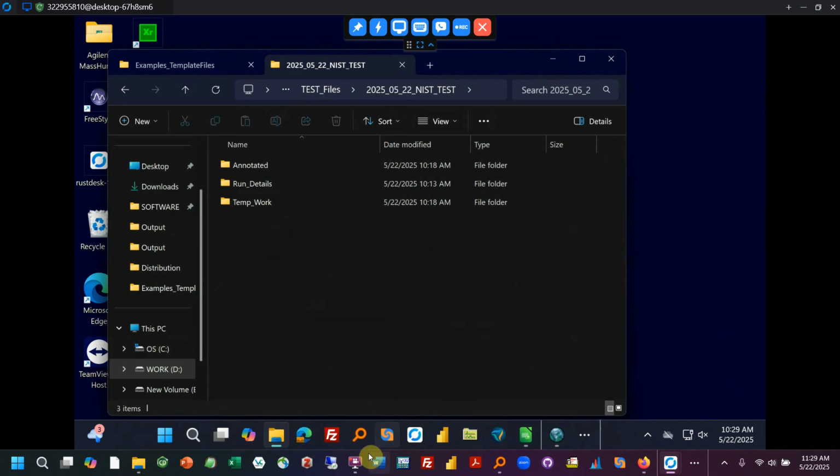Alright, so welcome to the tutorial describing the interface for FluoroMatch, LipidMatch, PolyMatch. All of our software workflows share the same interface.